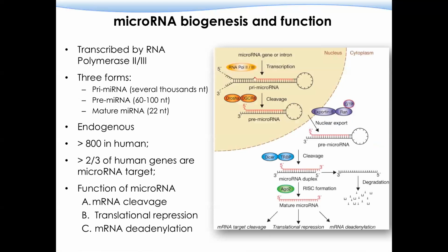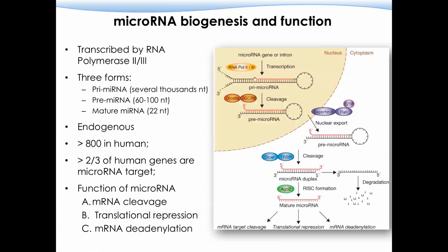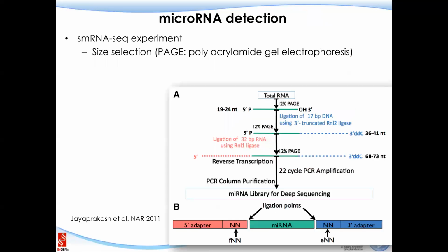One thing I have observed is that the variation among microRNAs across different patient age groups, different tissues, and different cancer subtypes is very high. It's much higher compared to mRNA. So please be cautious about the stability of microRNA, especially what can be reflected in your data. And here is a microRNA detection procedure.